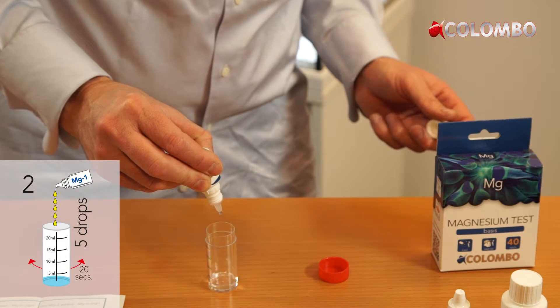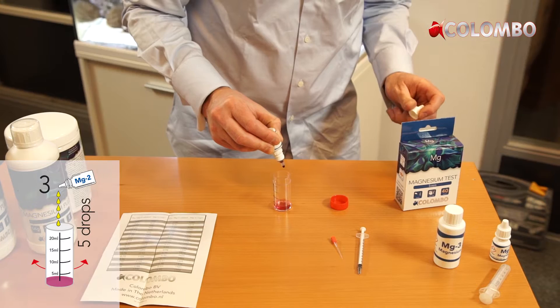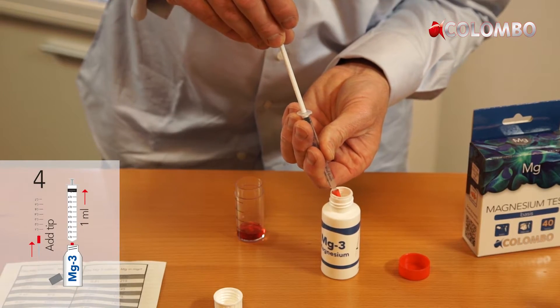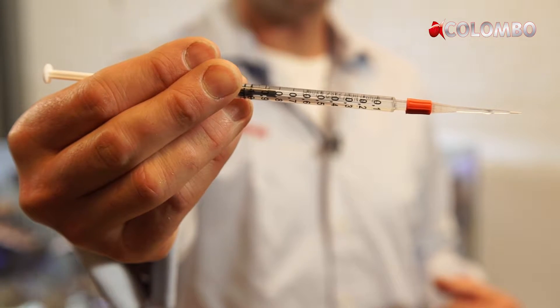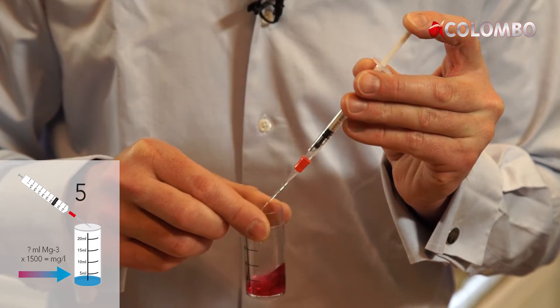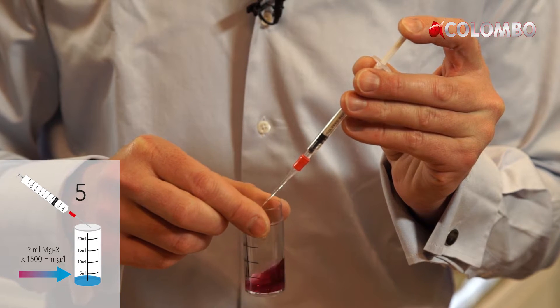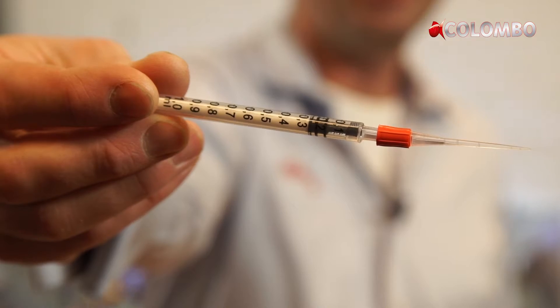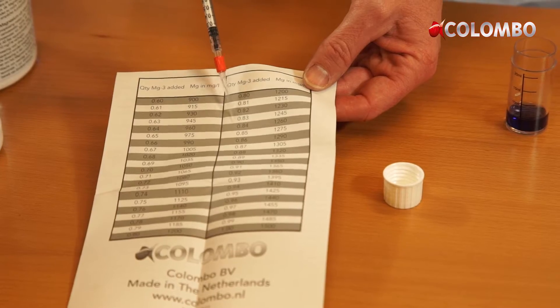Corals and other living organisms in your tank will absorb magnesium. This will reduce the magnesium level in the water. Optimal magnesium content is between 1250 and 1300 mg per liter.